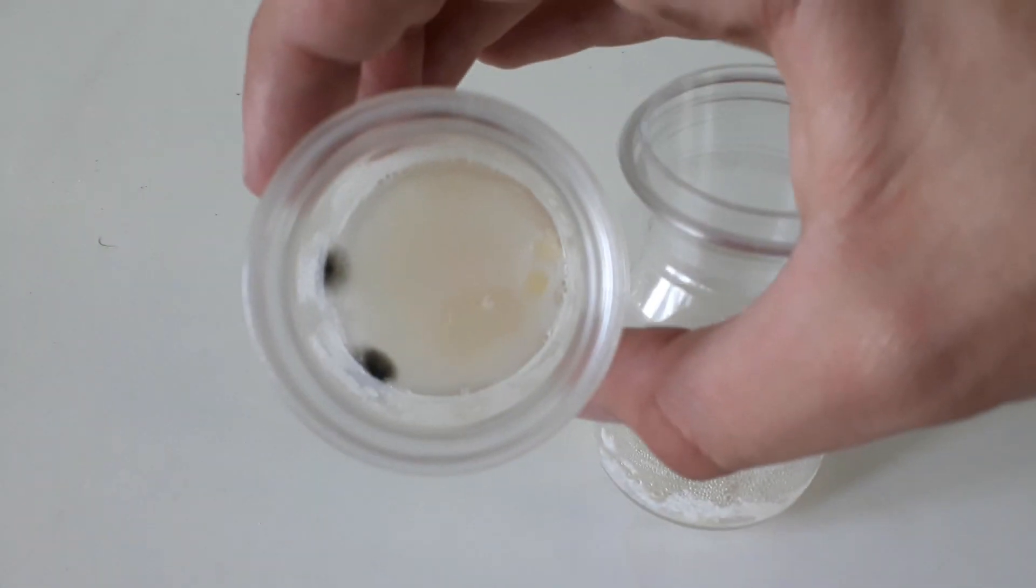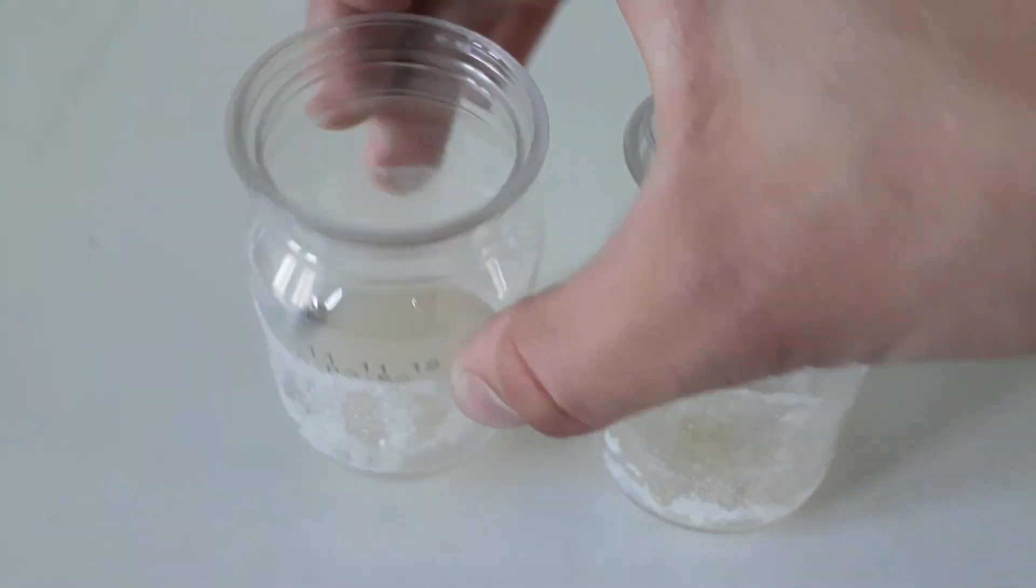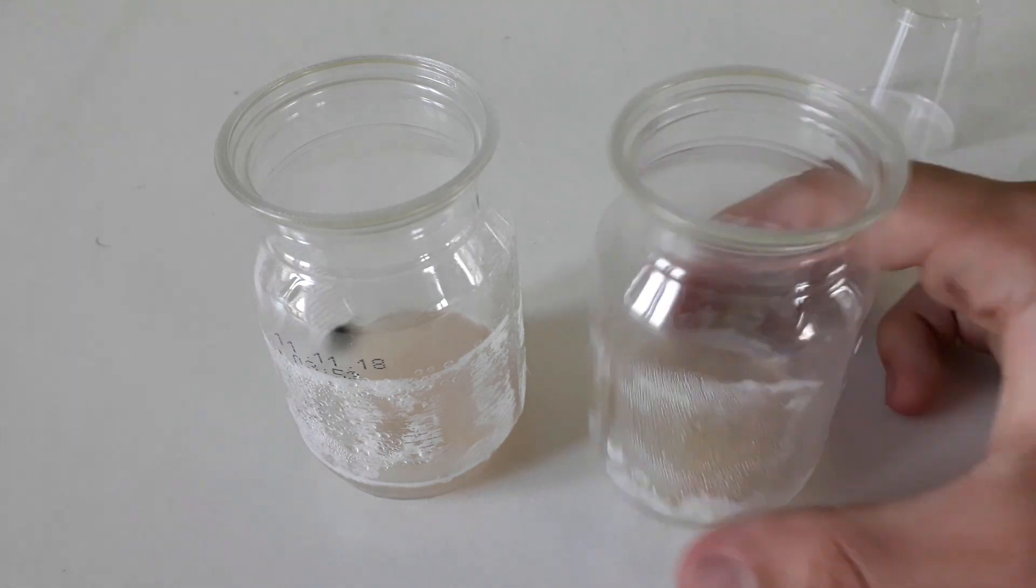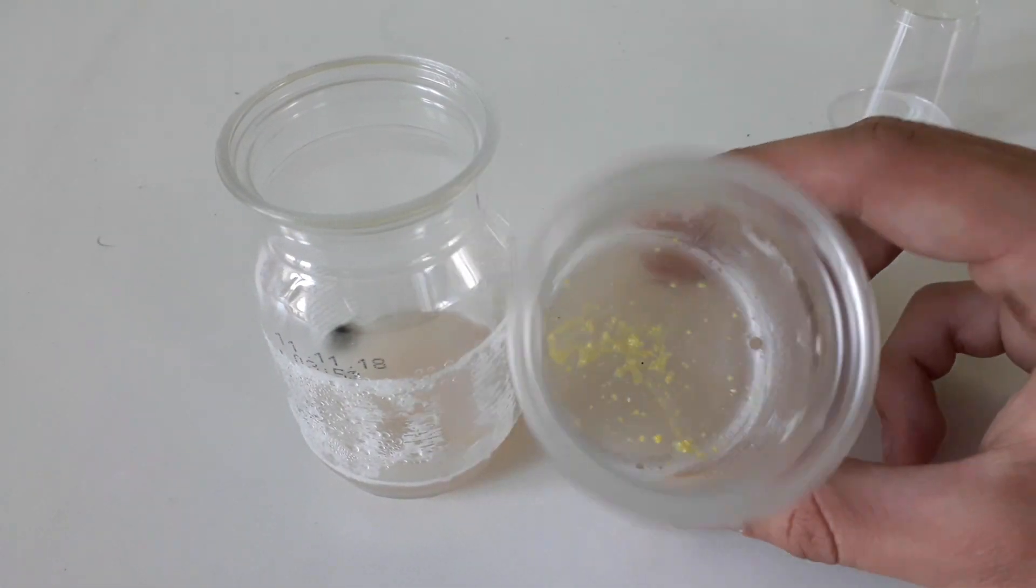And after two weeks, this is what it looked like. The cup on the left clearly has stuff growing in it, whereas the cup with the iodoform in it is completely free from fungal or bacterial growth.